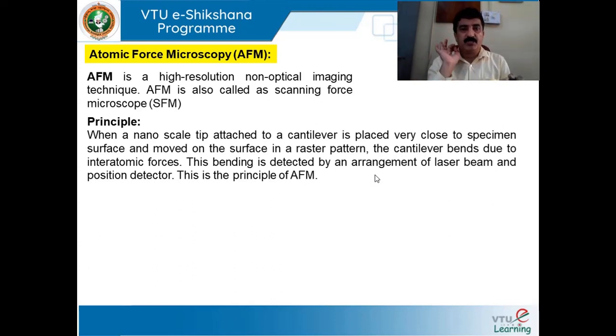I hope you understood the principle of AFM. I repeat, the principle of AFM depends very much on the cantilever concept. Cantilever beam attached with probe, due to force of attraction it goes down.